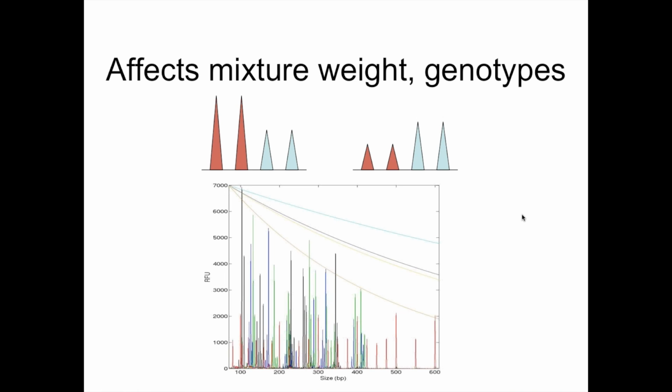And that's why it would appear that when we take the data measurement, the peaks from the blue contributor look higher now than the peaks from the degraded component in brown. And we get a flipping where towards the left, the brown contributor might appear to have twice the peak heights of blue, but towards the right, blue may have twice the peak height of brown.